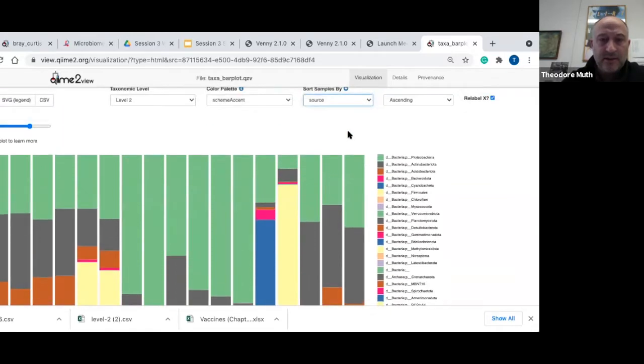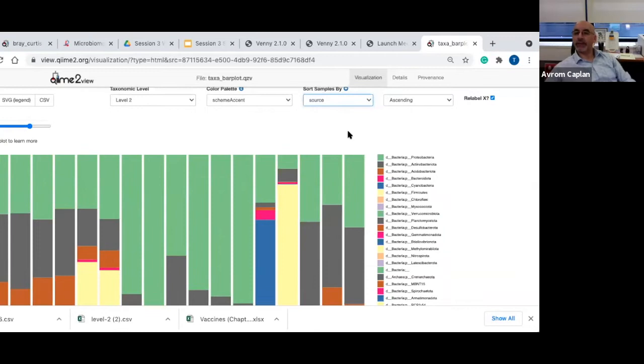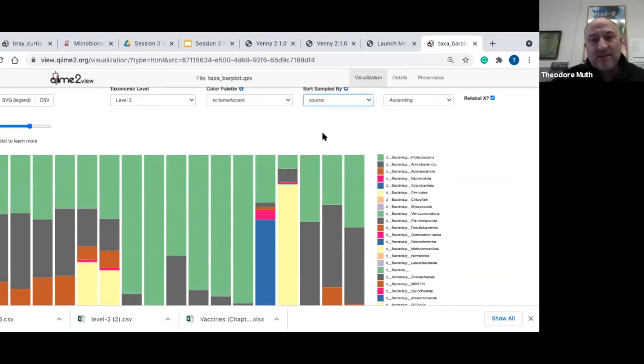Yeah, there is actually. Aaron Olsen wants to know, can you speak about accuracy when identifying genera and species level? So that's going to vary a little bit depending on the length of your reads. Again, we're only doing single end reads here, so we don't have the full length that you would have if you had paired end reads. With these data, I'm very comfortable at the levels of phylum, class, order, family. Genus is okay most of the time.